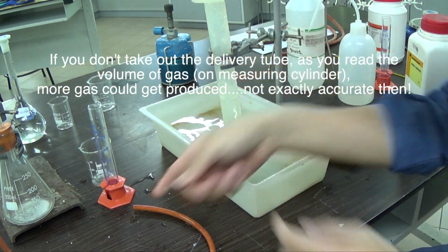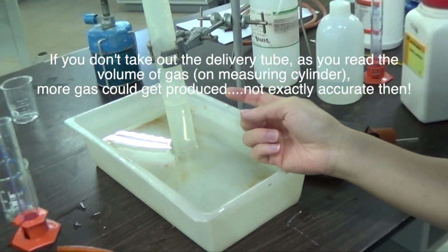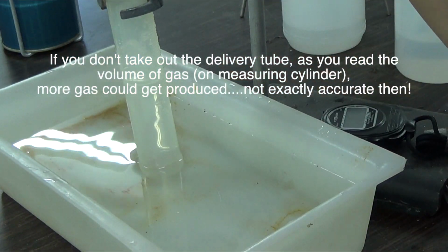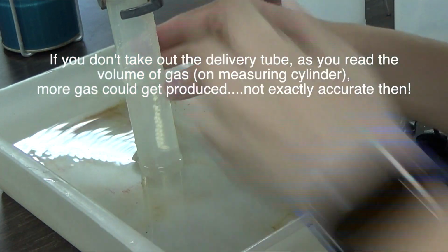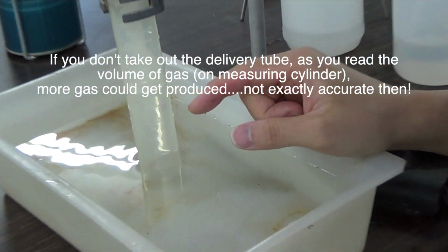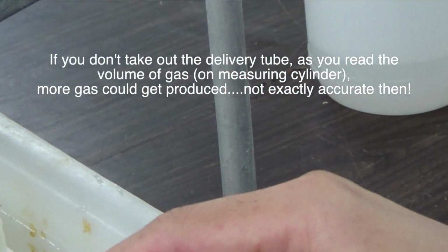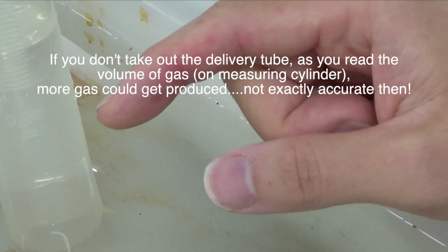the volume. If I don't take that out, it is continuously producing gas and it will not be accurate at all. So your volume has been displaced from 0 all the way to there. Here, let me see if I can make you see the reading a bit better. I don't think you will be able to see the reading that well, but I can try.